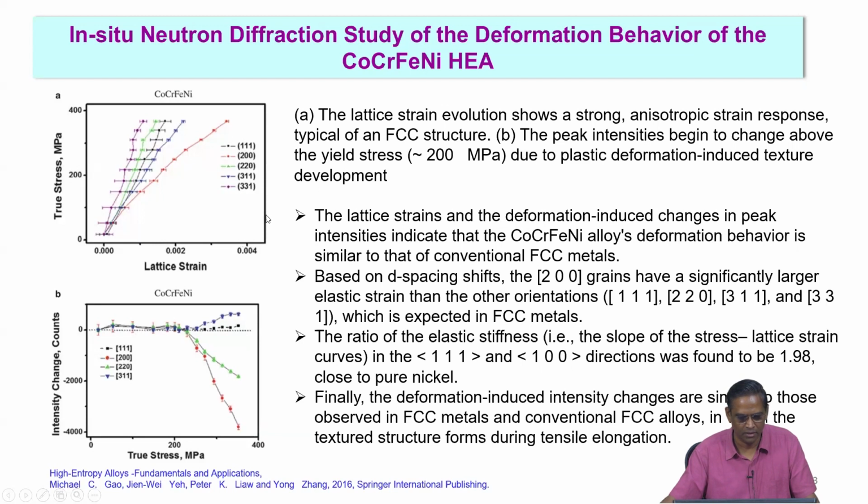What is interesting here? The lattice strain is significantly more in 200, right? It is very different from the rest of the orientations.